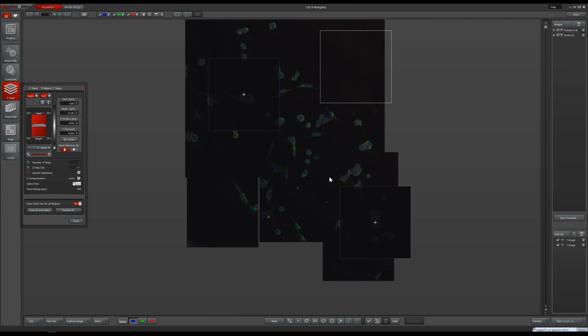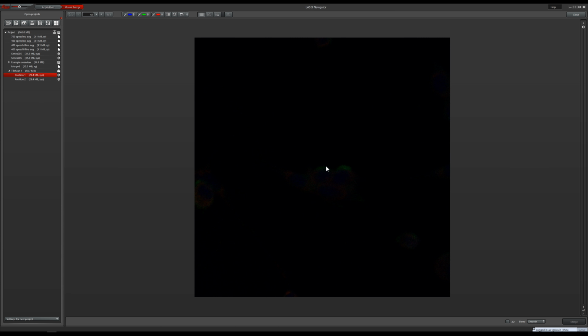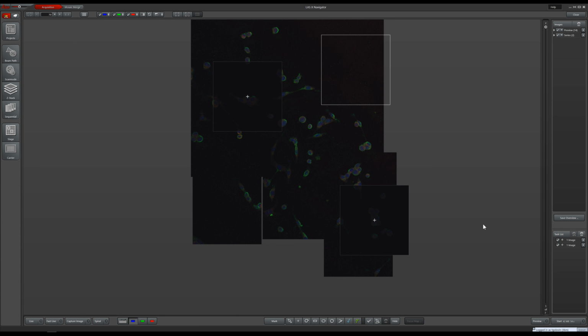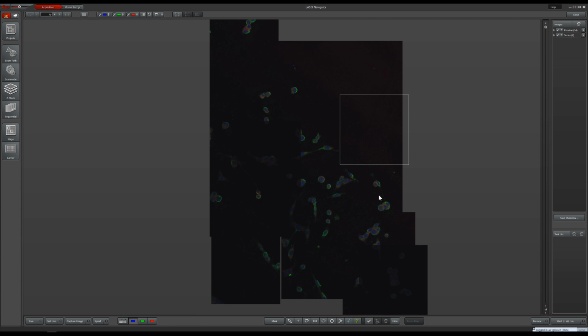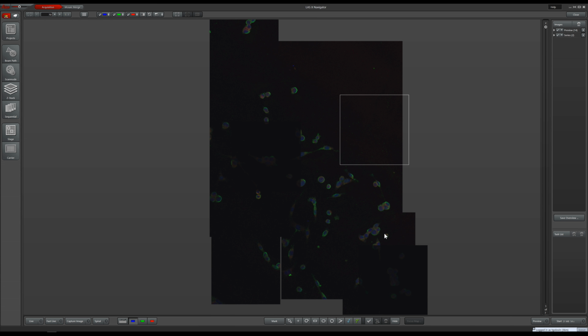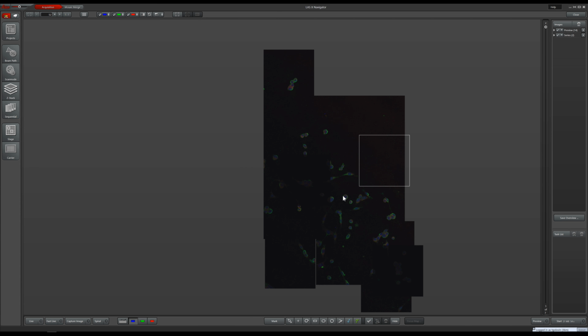If you are staying in the navigator and want to look through your acquired images, you can do that under Mosaic Merge and the Open Projects list again. Before moving to the next area, we recommend deleting those areas of interest from your task list, as the navigator will image all areas that are in the task list when you start your experiment. When closing the navigator, you will not lose the memory of the previous overview, nor will the overview itself disappear until you actively delete it from the images list.